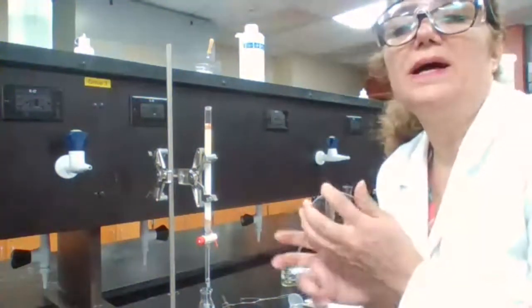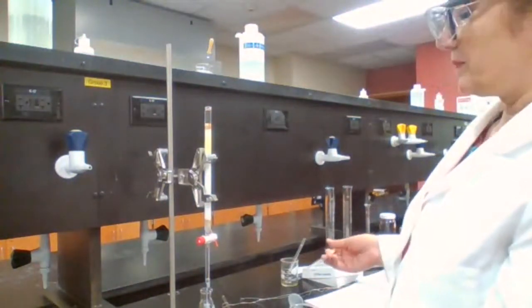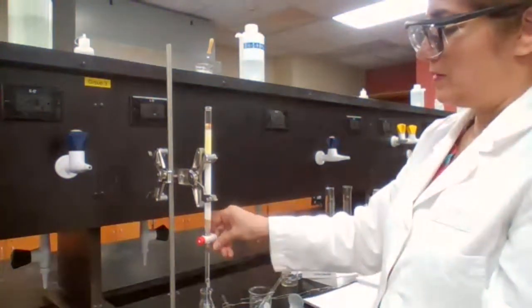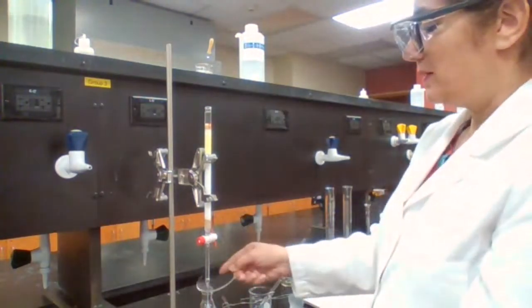Until all has been eluted. But how would I know? There is no color. How would I know that it is all eluted? How would I know there is no more fluorene coming out with the hexane?